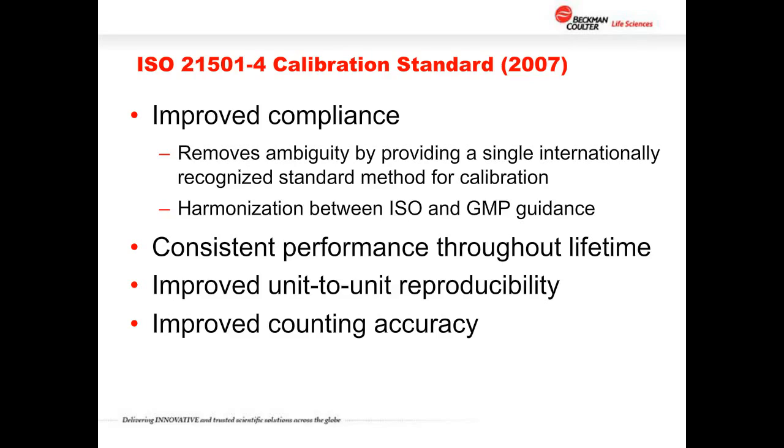The downside, of course, is it takes a little bit longer to do that calibration, takes more effort, and generally will somewhat increase the cost of that. But it does gain something for us in terms of the consistency of the instrument. And when you're setting up a standard, that's important. You want it to be reproducible no matter which tool you use, which instrument you use, and who does it. So that's the idea, of course, of a standard.